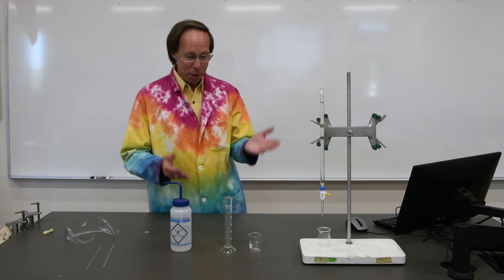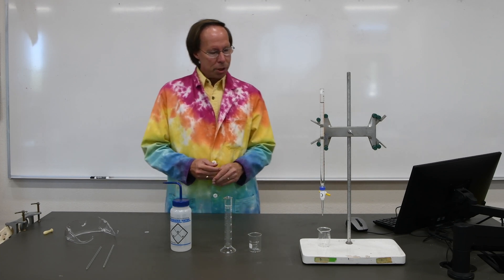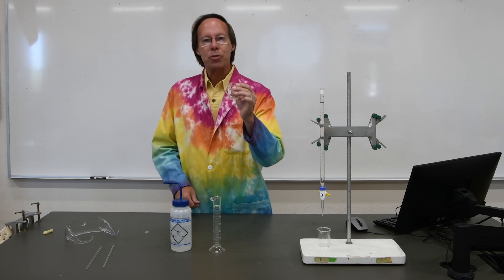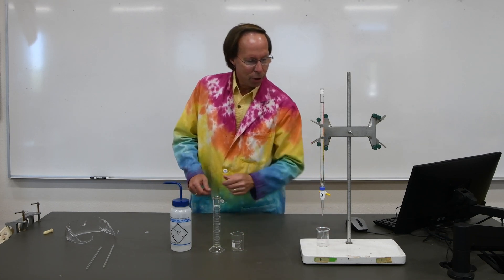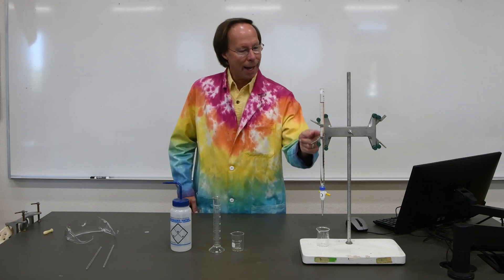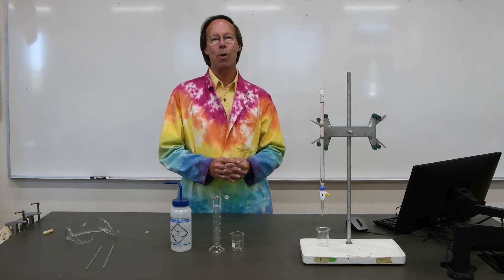You probably already have an idea which of these is going to be the most accurate and which is the least, but let's go ahead and try it. The first thing we'll need to do is weigh the three containers. We're going to weigh the graduated cylinder before we add the water, and also the beaker before we add water. We'll use a beaker to collect the water from the burette because it's difficult to weigh the burette before and after — it doesn't lay on a balance very well. So we'll simply add the water to a beaker and weigh that.